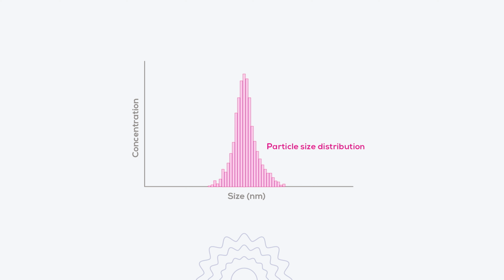it relates to size. This is the aptly named particle size distribution, and it visually shows what the size distribution looks like and how it compares to other samples. Finally, the polydispersity index gives an idea of how polydispersed your sample is by looking at the relationship between the standard deviation and the mean size of particles in your sample. This is a numerical value which can be used to compare LNP quality, with lower polydispersity indexes, preferably lower than 0.3, being more favourable, as they suggest a more monodisperse and stable lipid nanoparticle population.